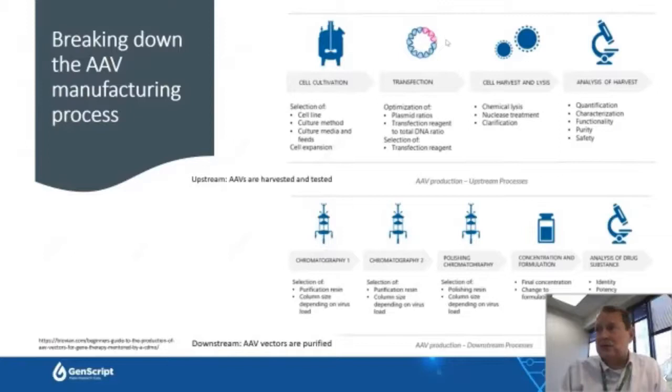So it's a large amount of surface area that's required for this transfection, and from this process, you get about 100 doses. There are several ways to do this using plates as well. We tend to want to move toward a non-adherent cell line, which allows us to do many more doses. So I will talk more about that in upcoming slides.